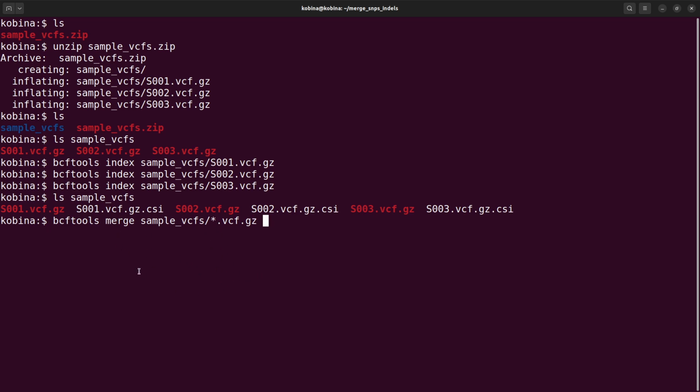Again, there are about 3 different approaches to specify input files when using bcftools merge. I have a separate tutorial on bcftools merge that gives all these approaches. In this tutorial, I'm giving just one approach. There are others as well, so take notes. So here I have this, and I'll say -Oz, meaning I want a compressed file as my output. And I'll say -o all_samples.vcf.gz. This is going to be the output file. So now let's execute this command.